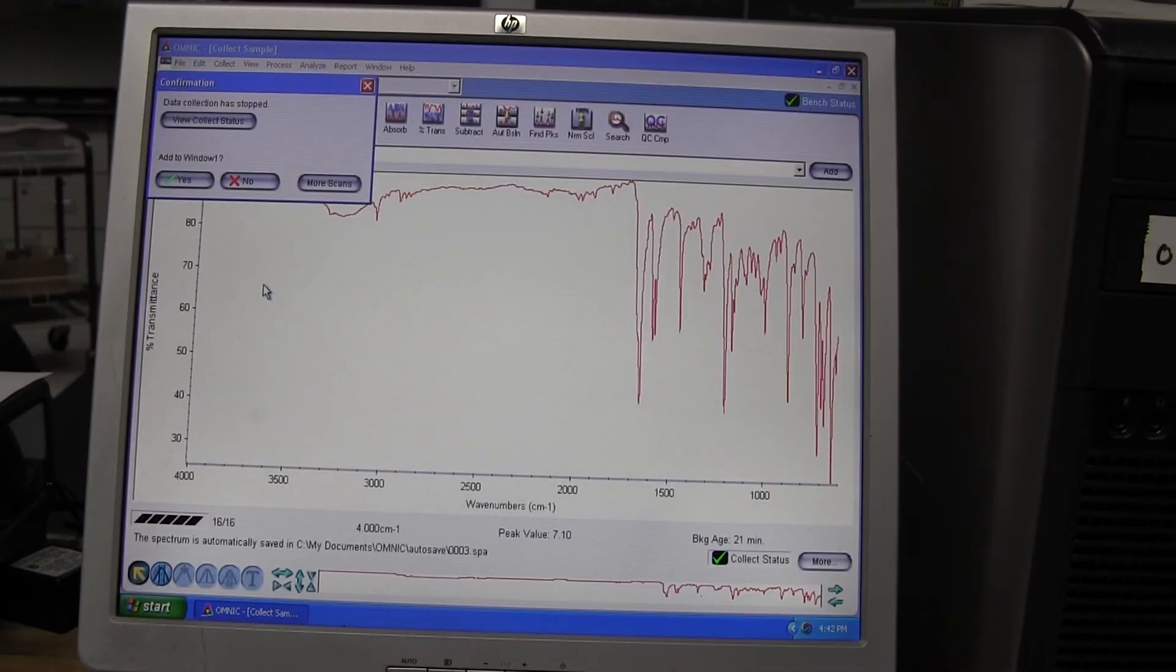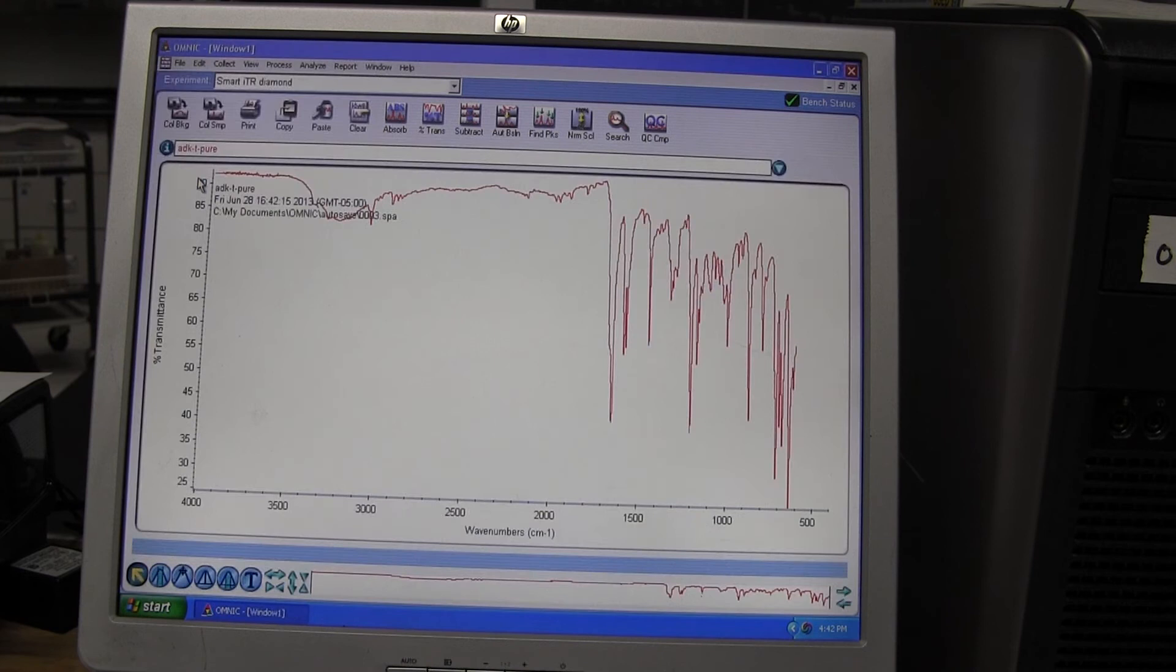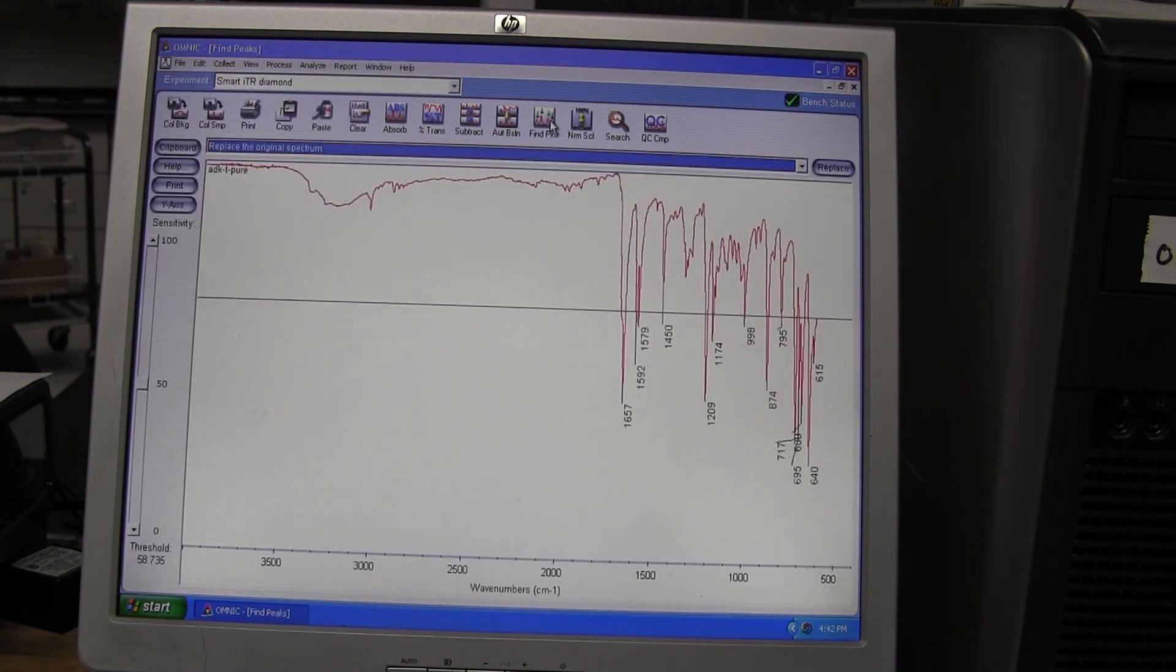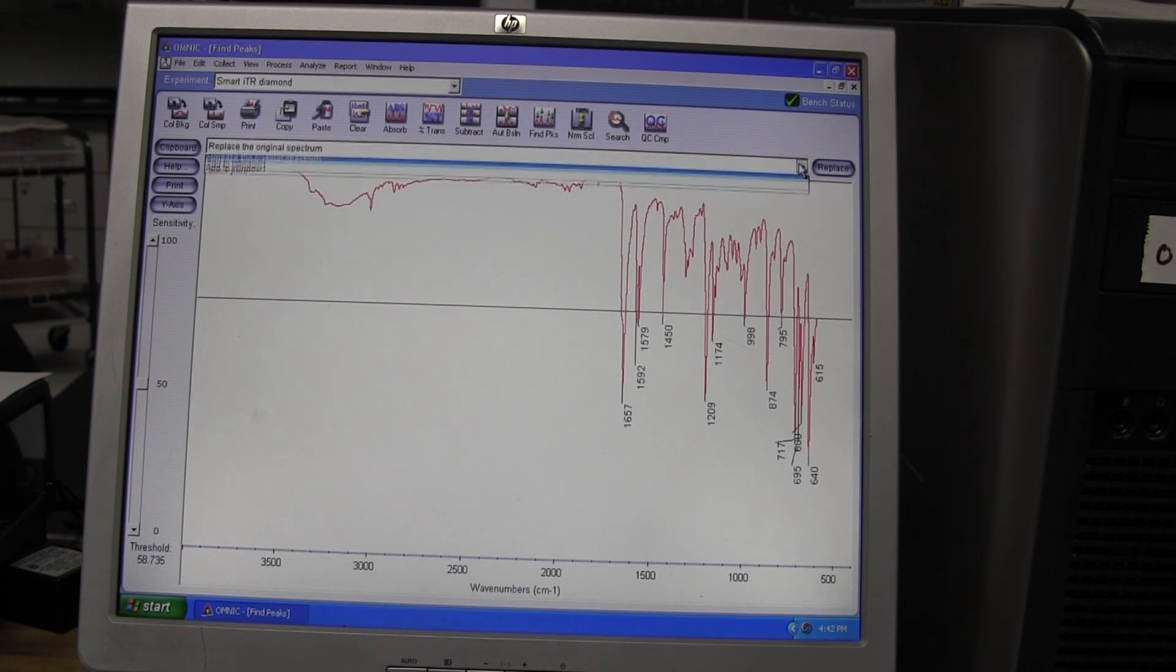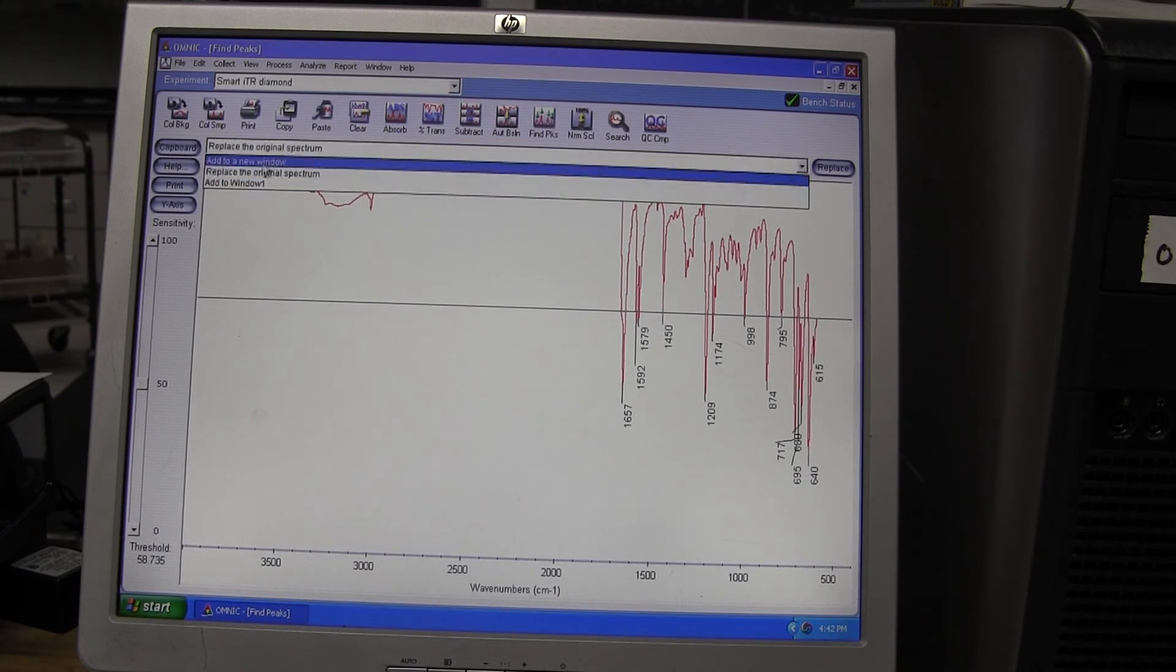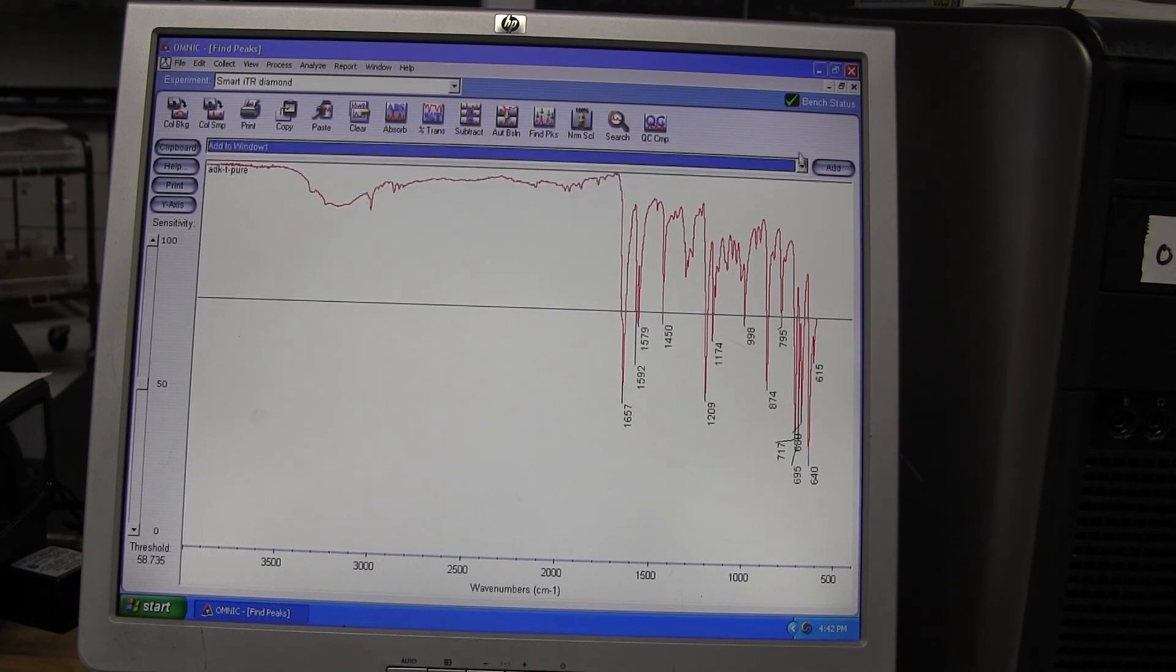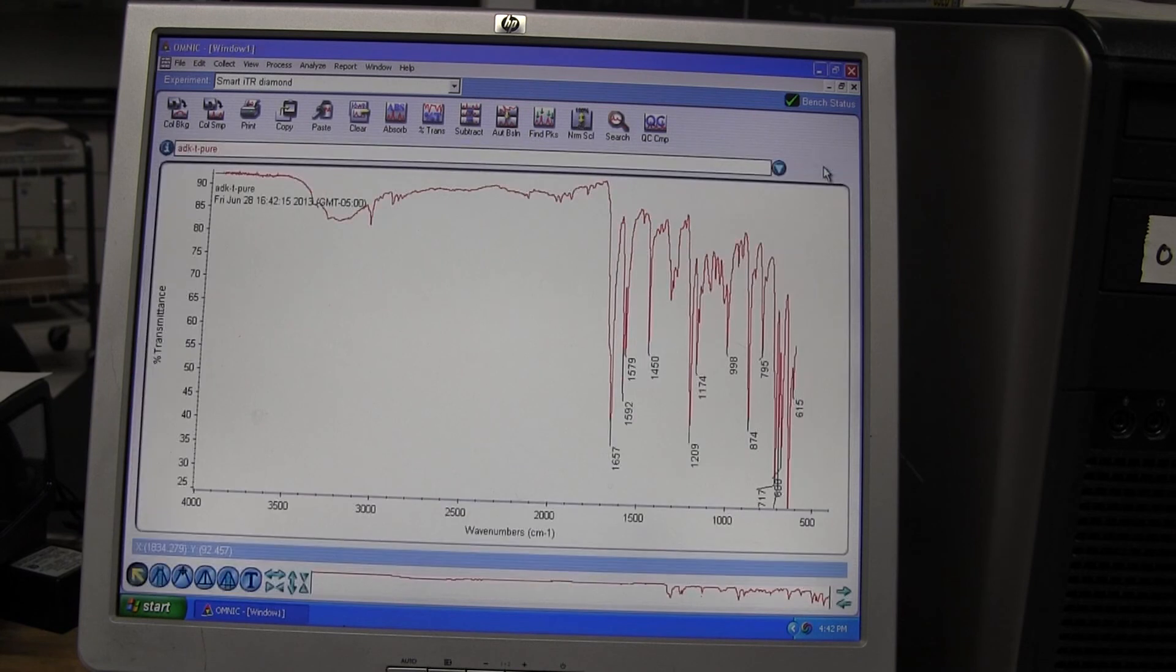A new window will inform you when the data is collected. When it asks you if you want to add your sample to a new window, click yes and take mental note of which window it will be added to. On top of the menu, choose the Find Peaks button. It is on the right-hand side.